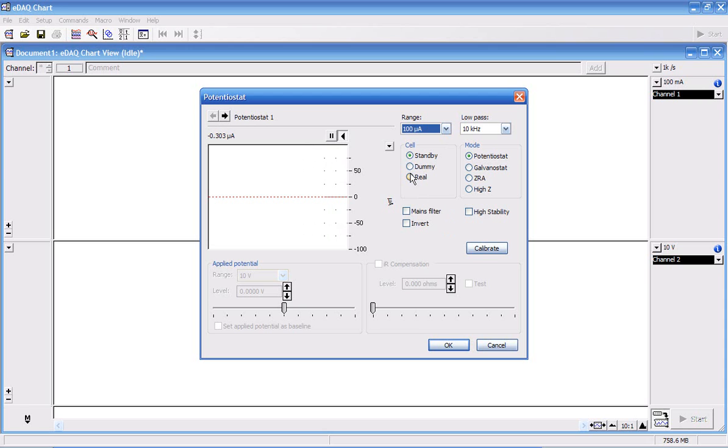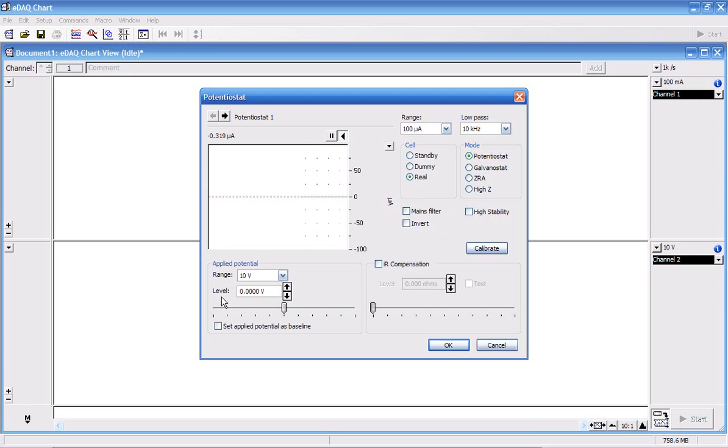You change the cell to real. And in here, you can apply the voltage.